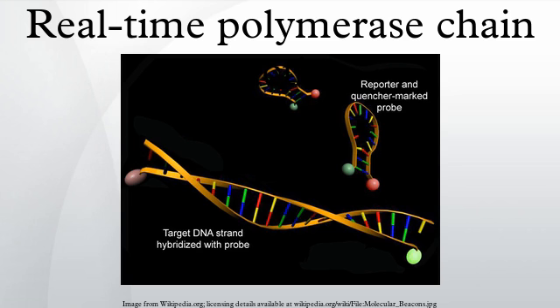Absolute quantification gives the exact number of target DNA molecules by comparison with DNA standards using a calibration curve. It is therefore essential that the PCR of the sample and the standard have the same amplification efficiency. Relative quantification is based on internal reference genes to determine fold differences in expression of the target gene. The quantification is expressed as the change in expression levels of mRNA interpreted as complementary DNA.